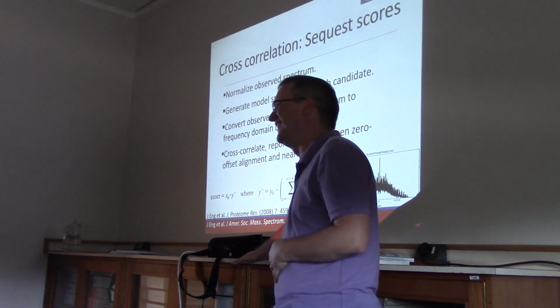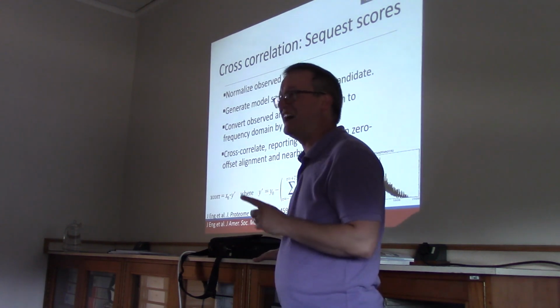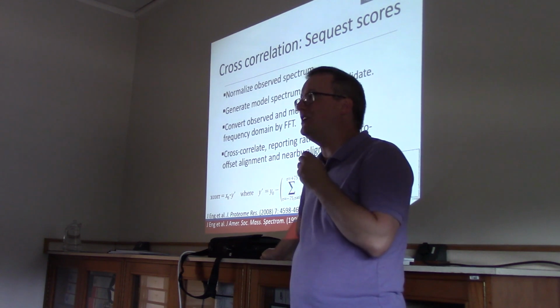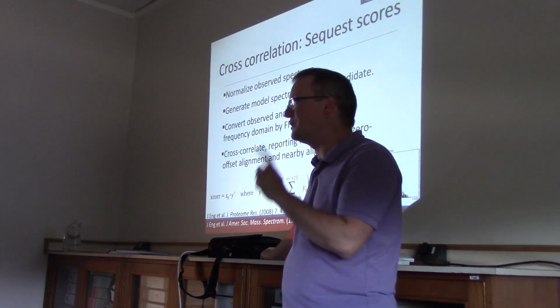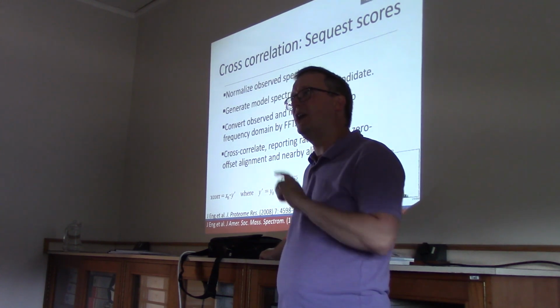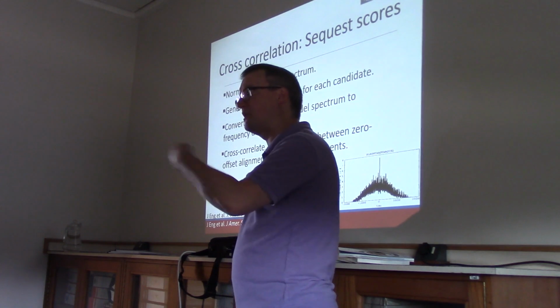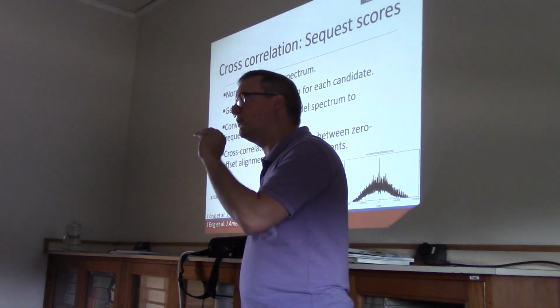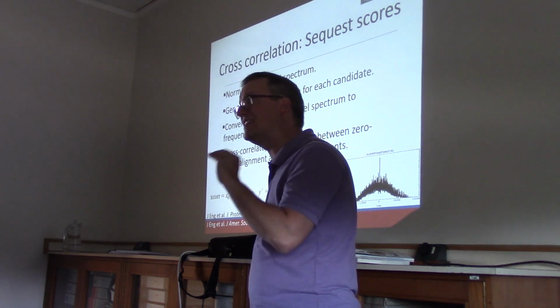So in 2008, he published this paper in which he noted that there was a math simplification error in the original 1994 publication. And after simplifying the math for Fourier transform, which we talked about before with Fred, shows up here again, after performing this correction of his math, the software was able to run 10 times as quickly.